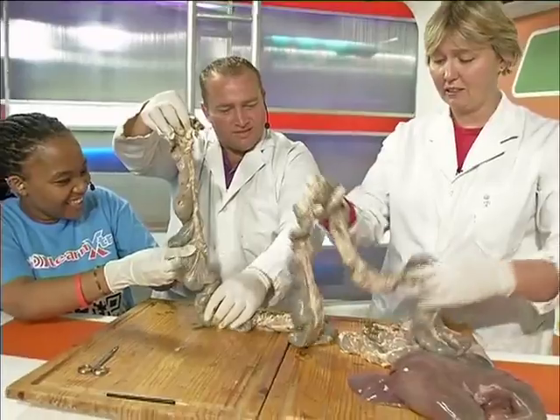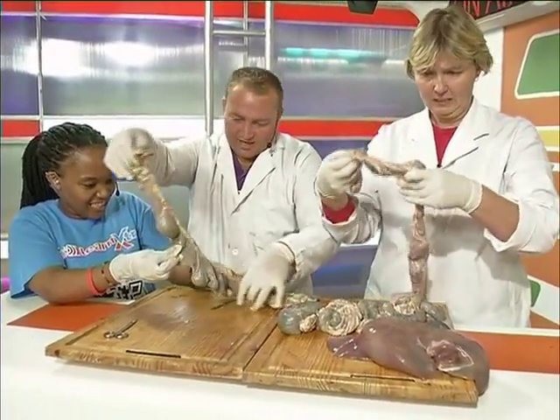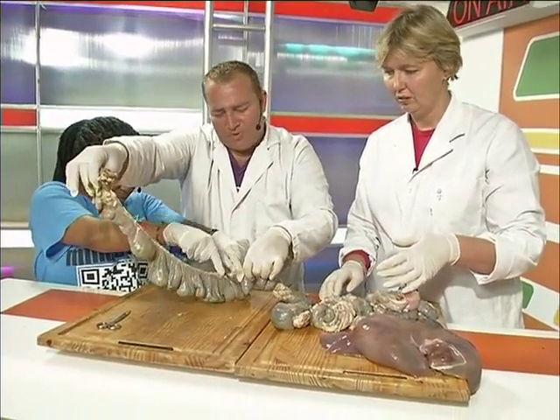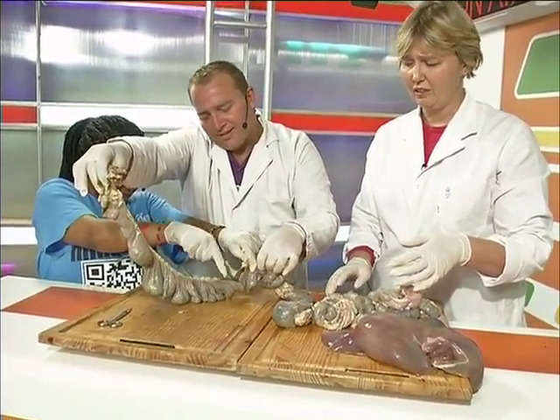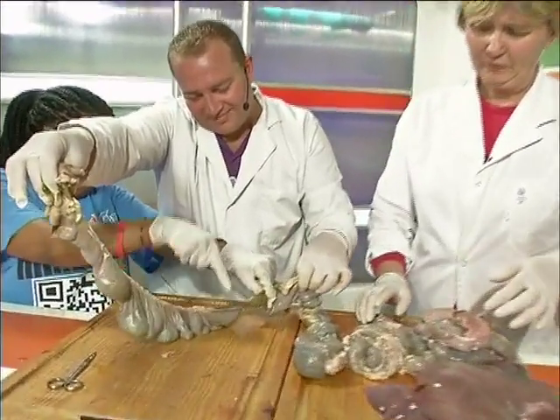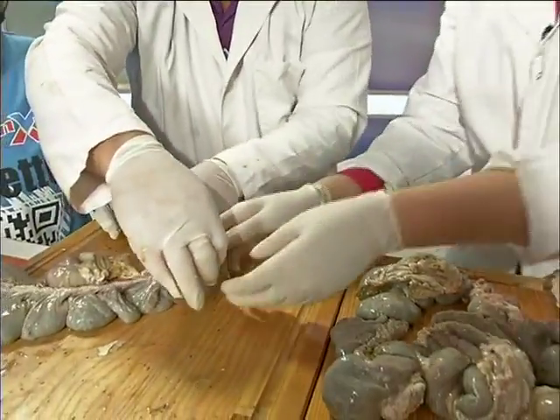Listen, I figured out that this little piggy did not go to the bathroom. So let's look at this. We're going to cut this piece here. So where am I cutting? There, right there. Cut, be gentle. It's too late. It's going to smell bad anyway. Cut. Right, piggy feces. Okay, one side. Pig feces. Here we go.